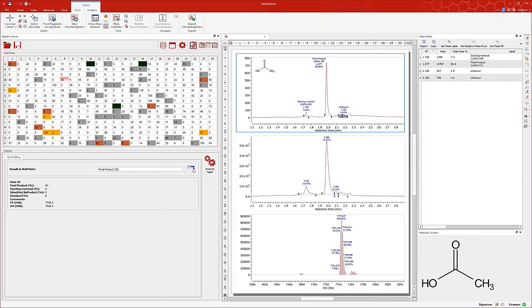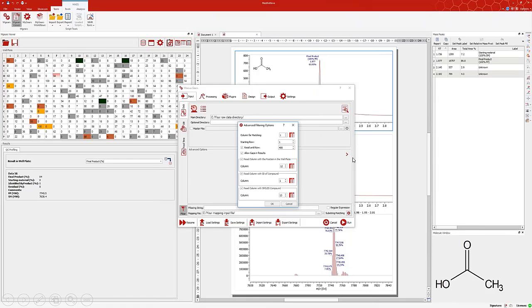The plugin works perfectly with any plate format, such as 96 wells or, like here, 384. But before coming to this point, you actually need to go through a few settings, of course. Mgears allows you to customize your input file, for instance by giving the option to define where your sample identifier is, which column defines the position in the plate, or whether you have SMILES of the compounds.